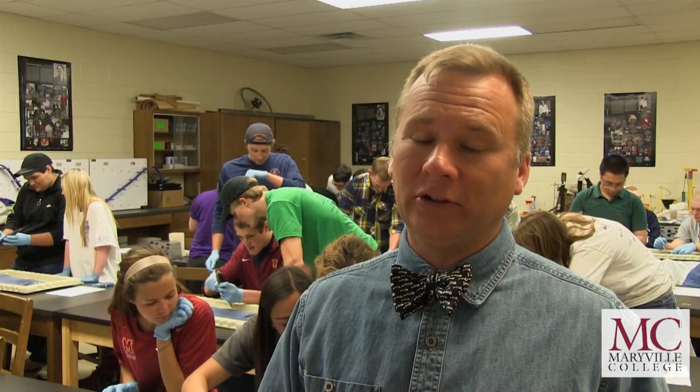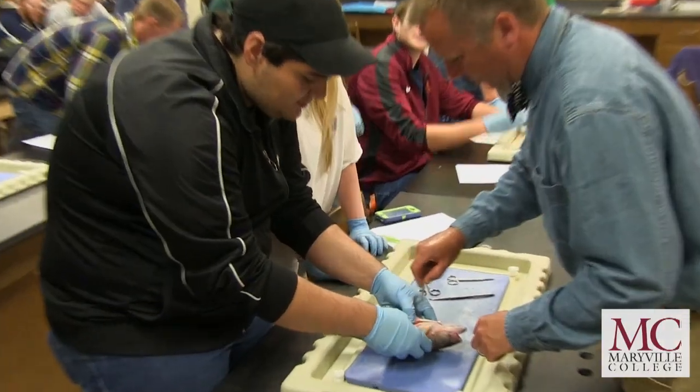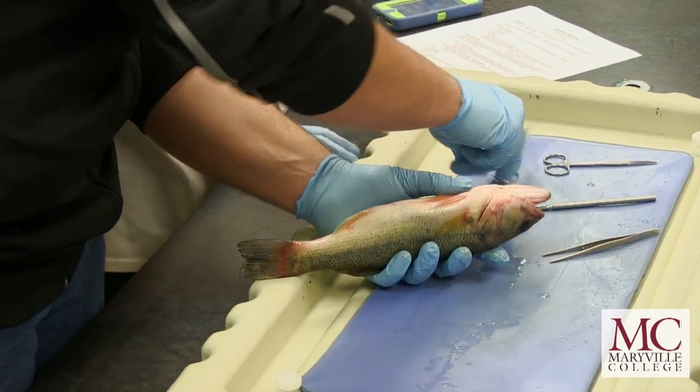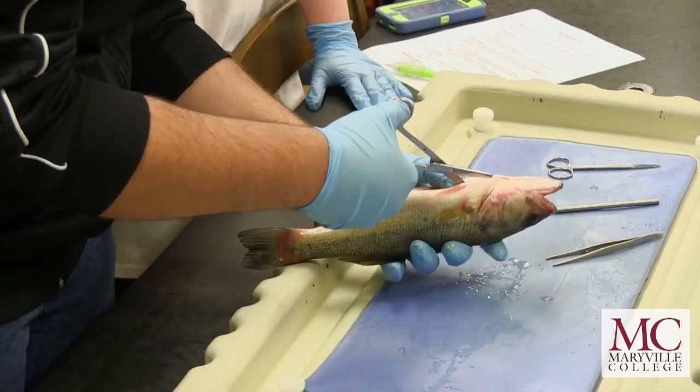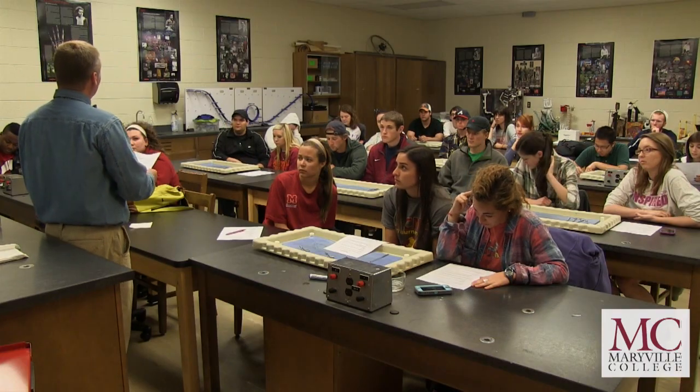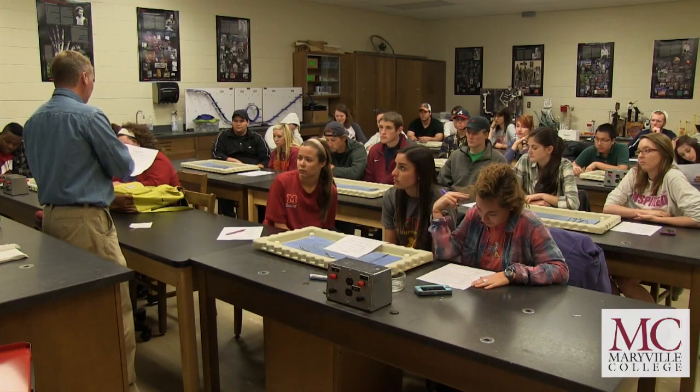I've always had an aversion to the formaldehyde-fixed, awful preserved specimens that you purchase for a lot of money. So what I did is I got a couple of friends of mine and recruited them to collect fresh fish. We have a lot of different species, white bass, largemouth bass, some perch. These are just like they were when the fish was alive and when any animal was alive. So it's much more realistic. The color is the same, the texture is the same. This is a true dissection, as it should be.